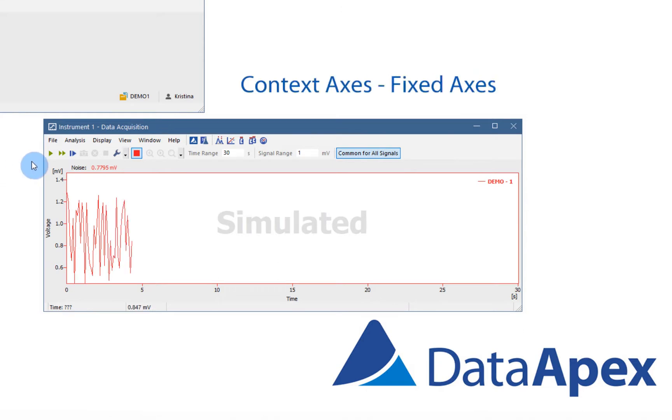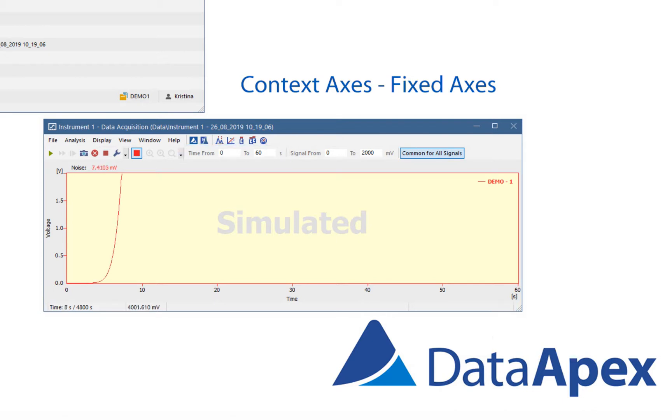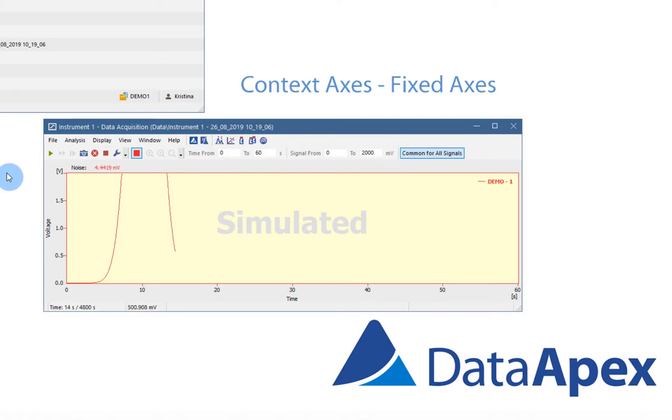Fixed axis is selected when there is a running analysis. Display is determined by fixed time, where you need to set the time from and to, and by fixed signal, where signal from and to is also set.